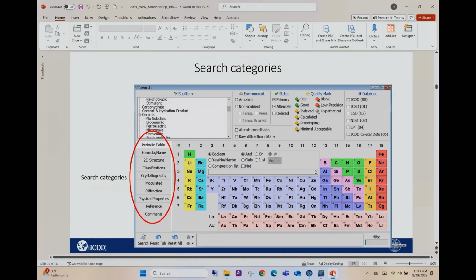I want to find the PDF reference which contains all atomic coordinates to do the Rietveld refinement. Generally speaking, you can do that. Thank you.